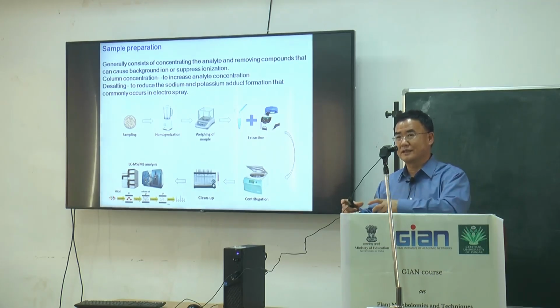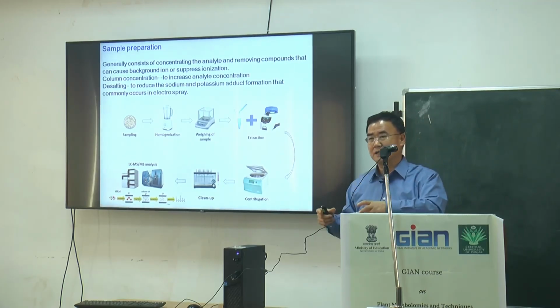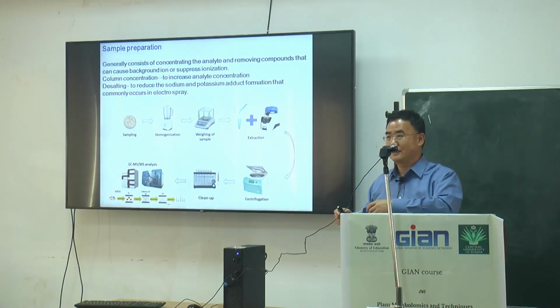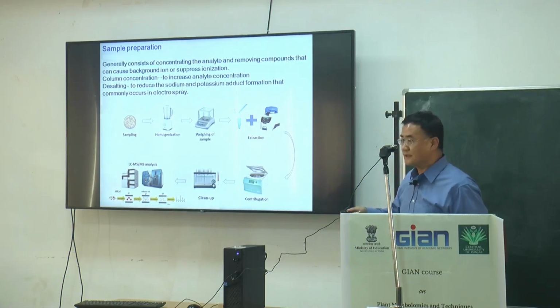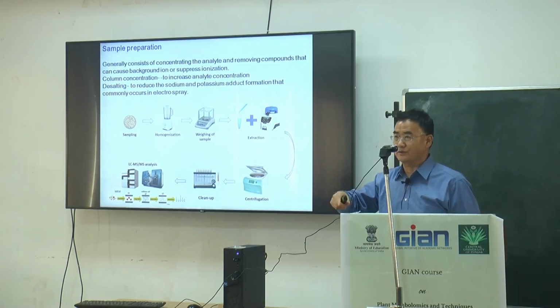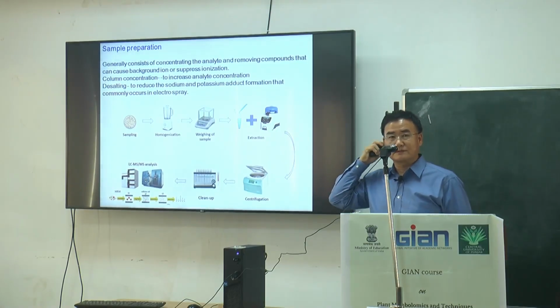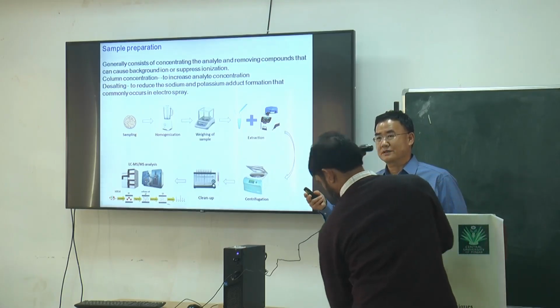But in seeds, there are a lot of storage proteins and carbohydrates like starch or other polymers. Those make metabolomics difficult, where we analyze targets only below 1,000 or sometimes 2,000, like triterpene, saponin, or sterol.